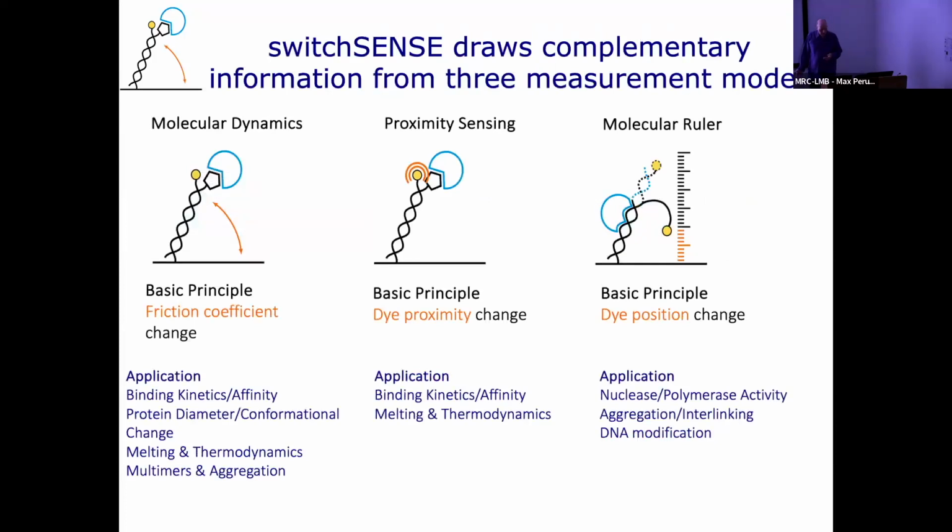And you can do several different kinds of experiments. You can actually look at, say, how this nanolever moves, or you could have the nanolever just standing straight up, just to have it as a very positive charge. And then you can look at anything binding by this fluorescence proximity event. If you remember back, if anybody came to the fluorescence lecture, if not, go back and have a look at that when it's on YouTube. That if something binds near the fluorophore, you can change the environment, and so then you'll see a change in the fluorescence.